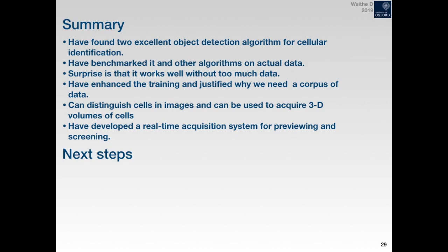So you could catch a cell just before it's about to divide and then switch to a time series mode and image that particular location. So we're basically allowing you to automate what you would do as a poor scientist sitting in a cold laboratory doing experiments for many hours, but also still trying to keep it fun with the augmented reality and giving you feedback. Sure. So I'll just finish.